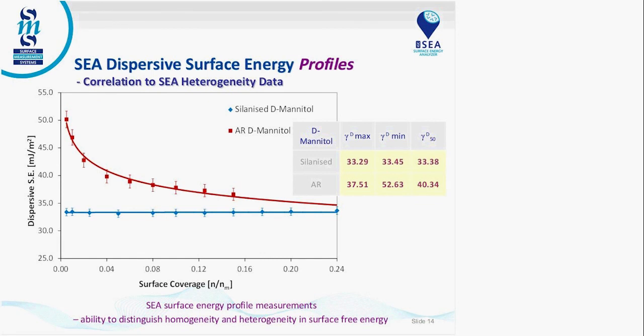So you have a question. For our method, we would always require you to either know the surface area, by measuring it by inverse GC or from nitrogen data. We require you to enter the surface area before doing any experiments, because we want to make sure that you compare values at the same surface coverage when you want to compare different samples. There's another question, so we do require the BET surface area either from our instrument or from another instrument, before you measure the surface energy.